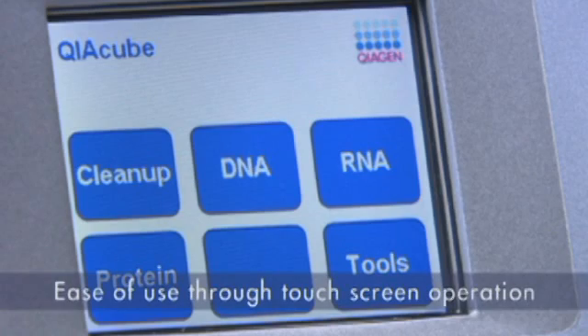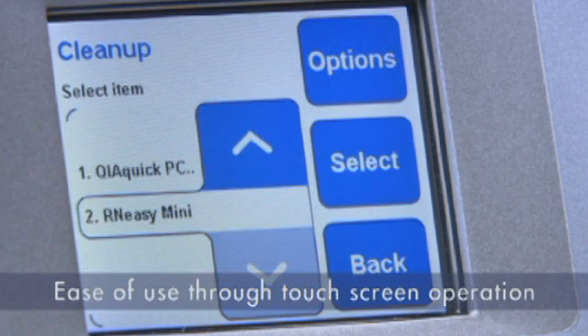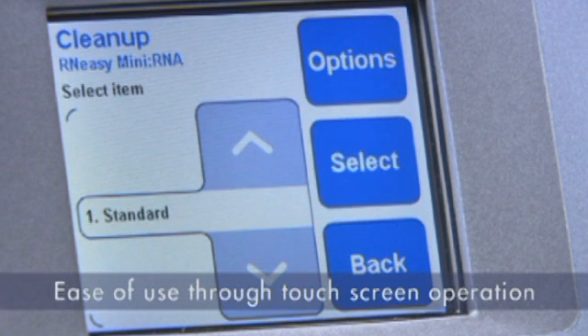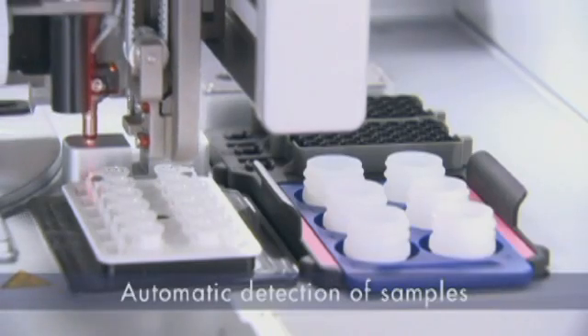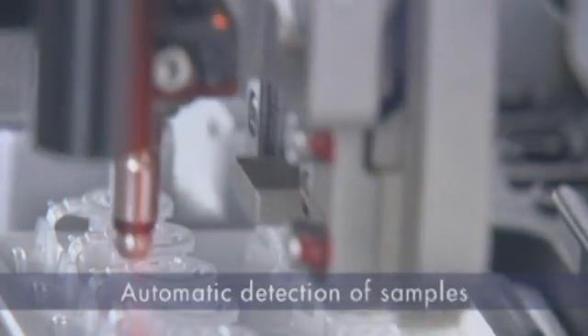The Kaya Cube takes ease of use to a new level and can be operated by anyone, from the novice to the expert. High process safety helps to prevent human error.